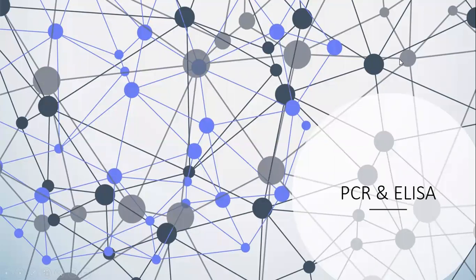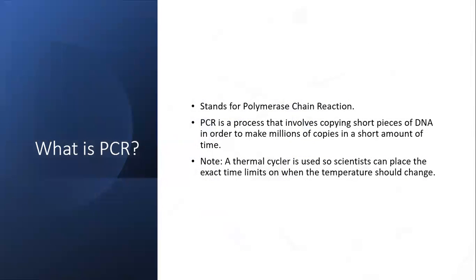Hello everyone, today I'll be teaching you about PCR and ELISA testing. Now, first off, what is PCR? PCR stands for polymerase chain reaction.